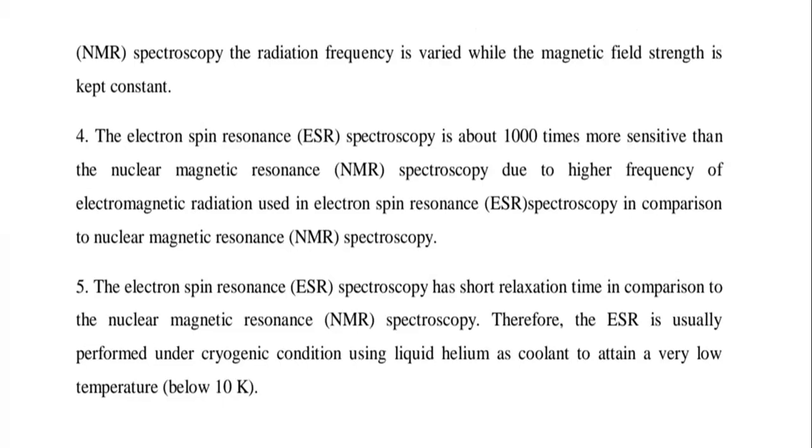Fourth point: ESR is near about 100 or 1000 times more sensitive as compared to NMR spectroscopy, because a higher frequency of electromagnetic radiation is used in ESR in comparison to NMR.